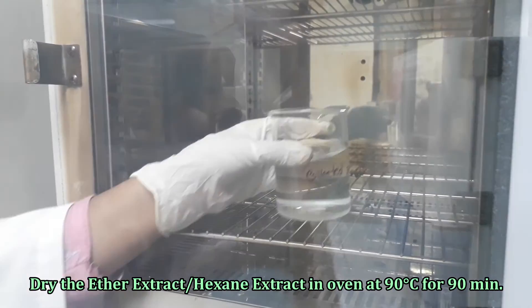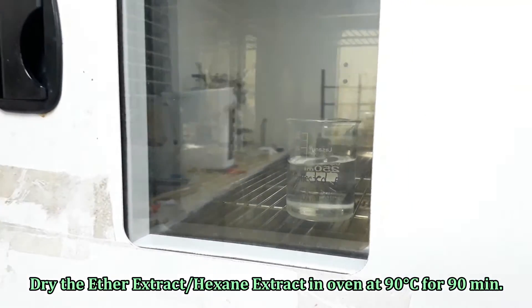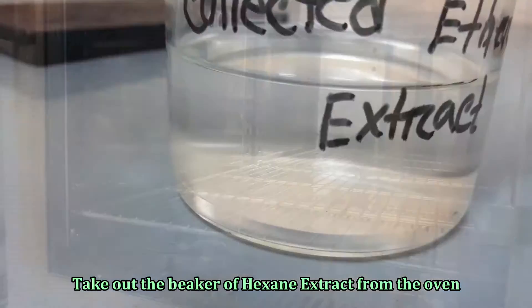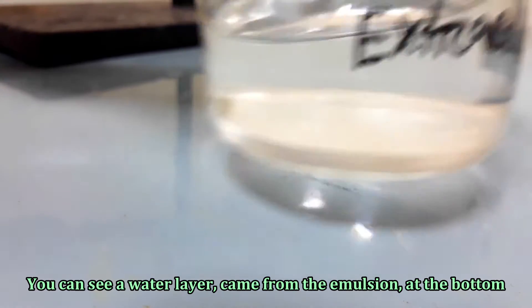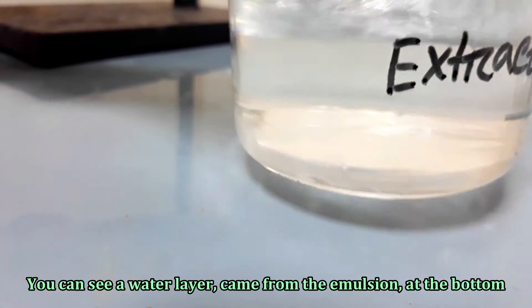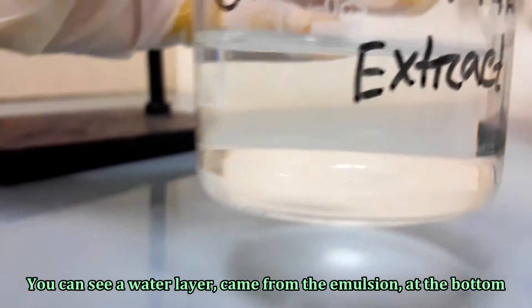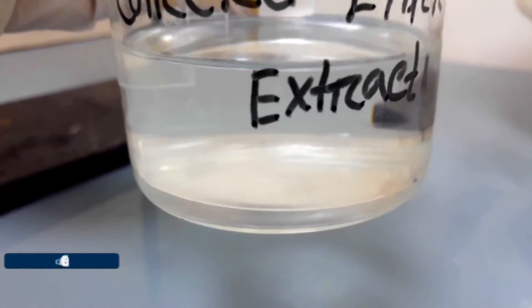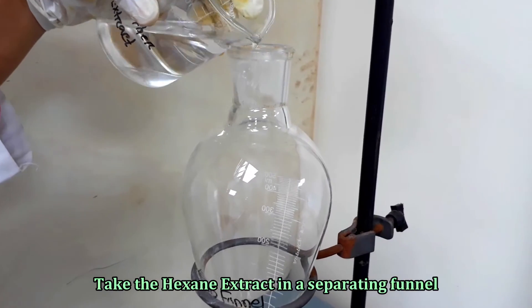Place the beaker in a hot air oven and dry at 90 degrees Celsius for 90 minutes. You can see a separate water layer at the bottom of the beaker. Now we have to separate and discard the water layer from the hexane extract. Pour the extract into a separating funnel.